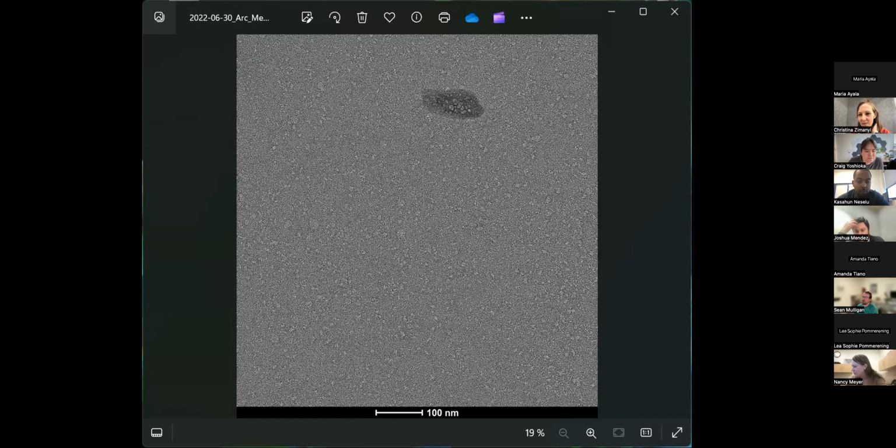It's not a burnt negative blob either. The dark shadow, right? And none of the shadow for the thicker ice with the bubbling. Is this just maybe overexposed already? A bit? This is exposed already in 54.